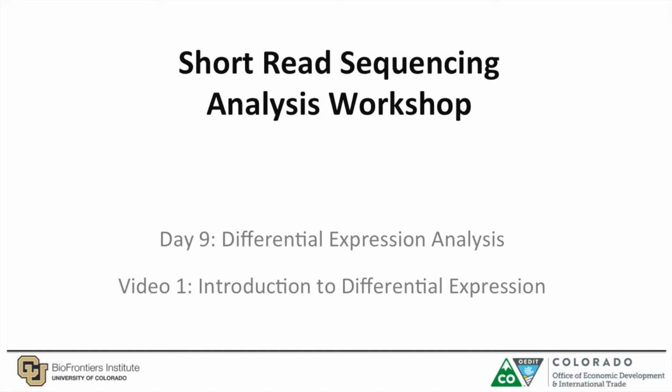Welcome to the second day of the RNA-seq section of the workshop. Today we'll be talking about differential expression analysis, and this first video will be giving a brief introduction to differential expression.